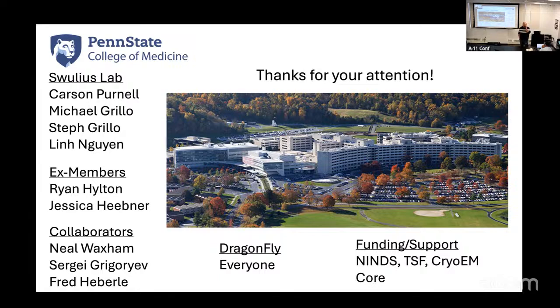I like what you guys said to do, because I had an image processing professor that would yell at us for adding Gaussian noise to tomograms. He'd say, the noise isn't Gaussian, don't do it. Yeah, we don't really have a noise model in that way. The simulation here is fine, you could make your own noise model that way. And synergy would probably be good, from the very lazy tests that I've done. There are various synergistic advantages.